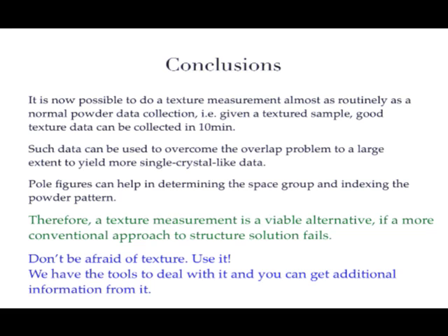Depending on the HKL, on the 2 theta, as Christian was showing, you have something turned. So you cannot really select exactly the point on the hexagonal grid that covers the equal partitioning. So you end up taking the closest point to each. And so the closest point actually turned out to be a little bit random, but it's only because it's the closest point to a hexagonal grid over the pole figure.